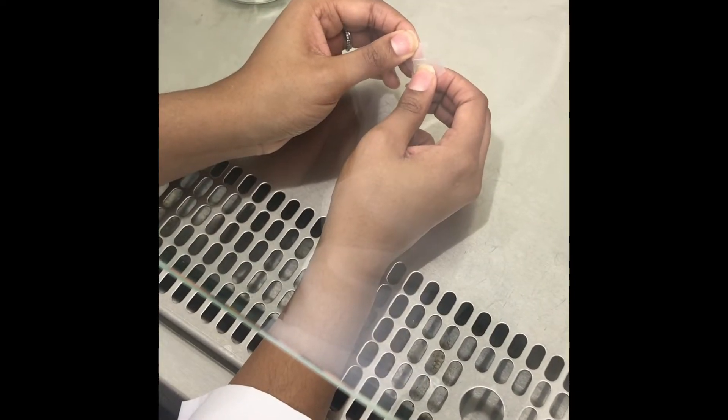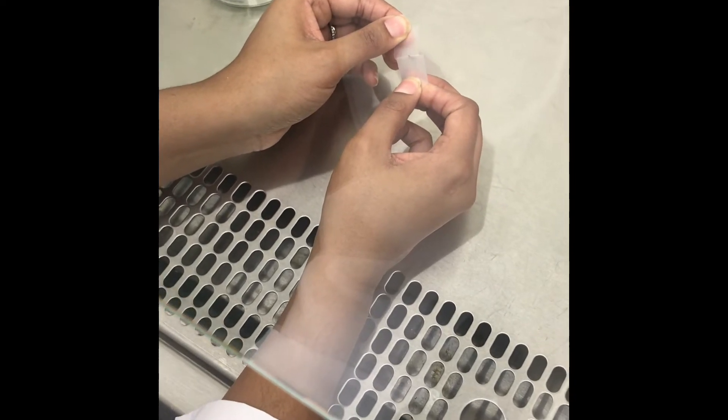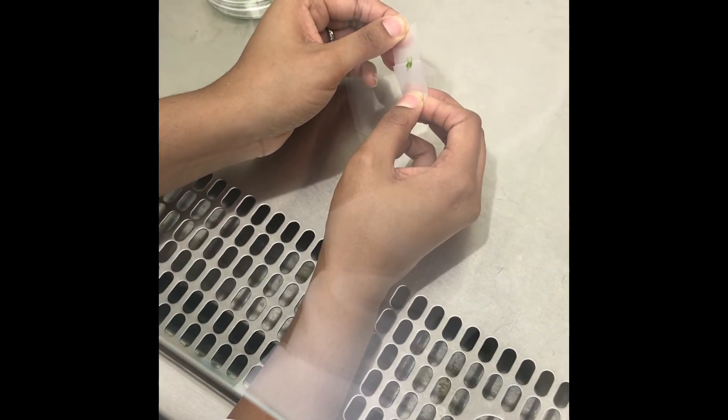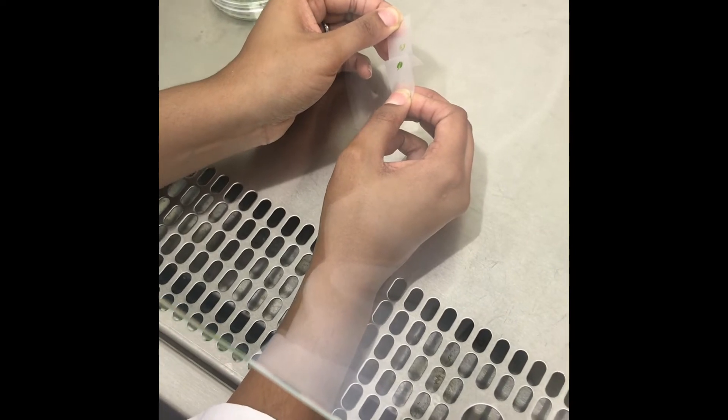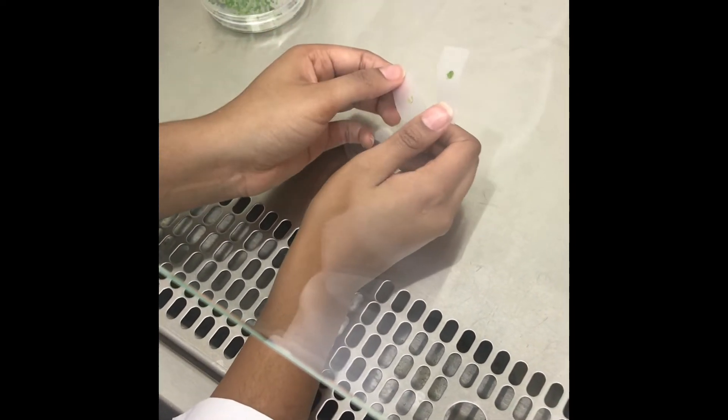So now we're going to slowly remove the pieces of tape from one another. And as you'll see we'll have two separate layers of cells.